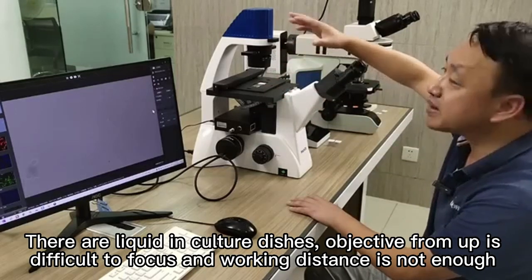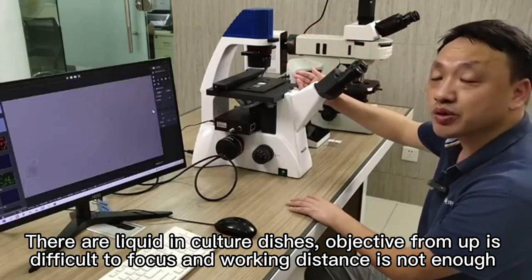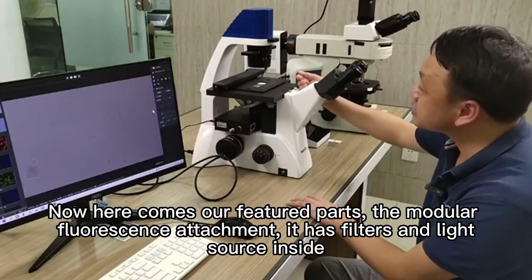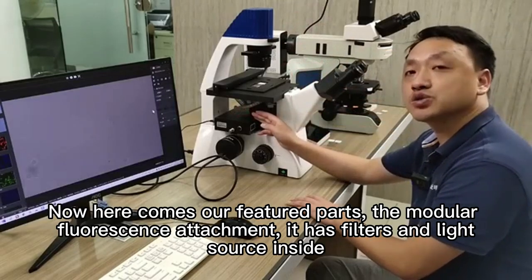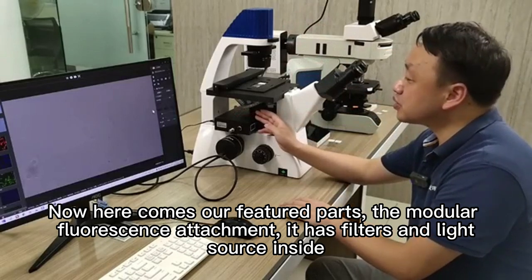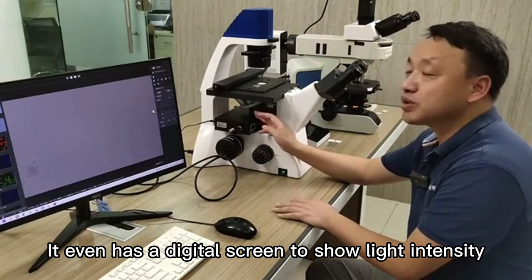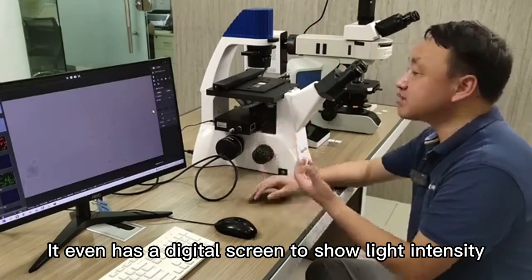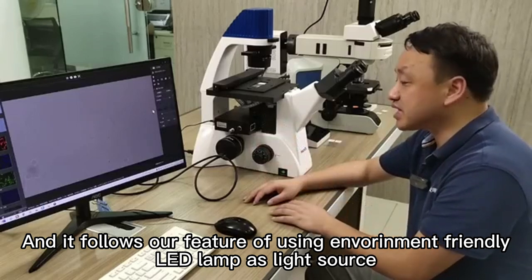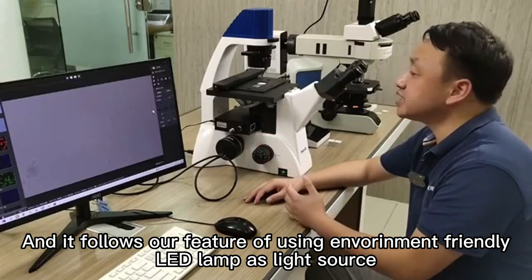With a conventional objective on the nosepiece, it is difficult to focus and working distance is not enough. Now here comes our featured part: the modular fluorescence attachment. It has filters and light source inside, and it even has a digital screen to show light intensity. It also follows our feature of using environment-friendly LED lamps as the light source.